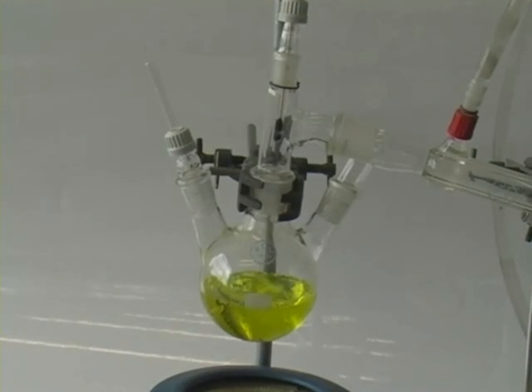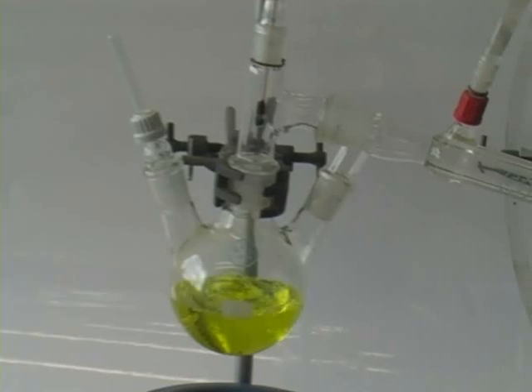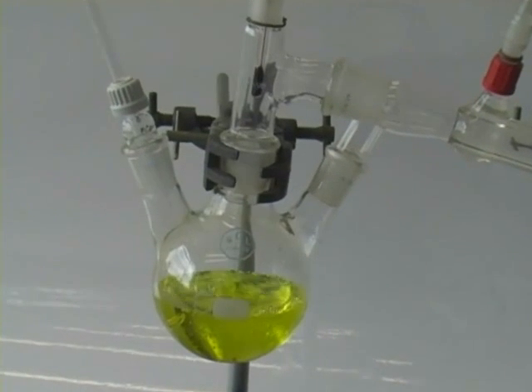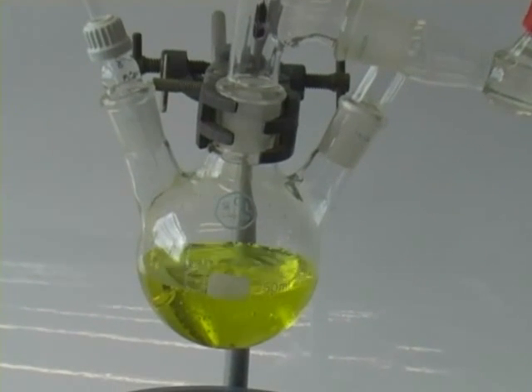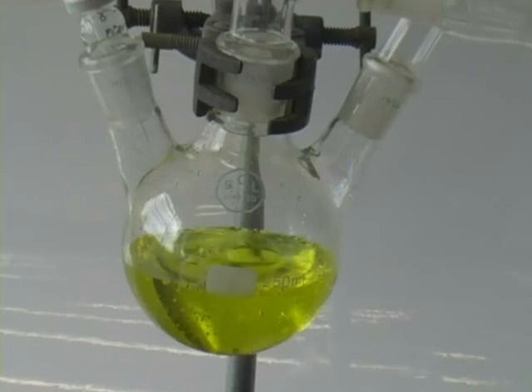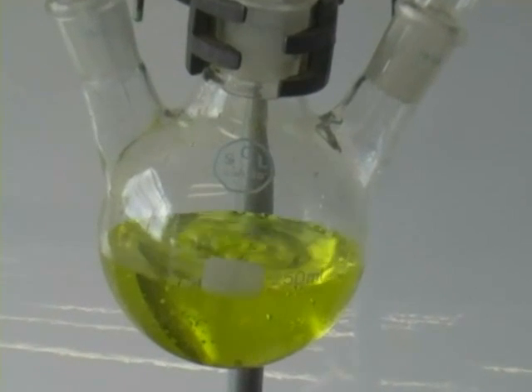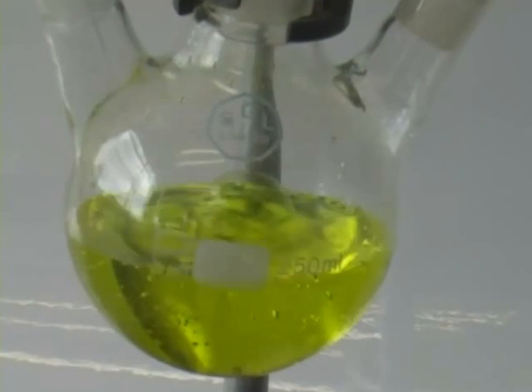We can then insert this into one neck of the flask so that the air bleed is dipping into the liquid. Here you can see the apparatus is currently under vacuum and with the air bleed in place, a small amount of air is being drawn into the flask. This bubbling prevents the solution from bumping, which is safer in this case than using an anti-bumping granule.